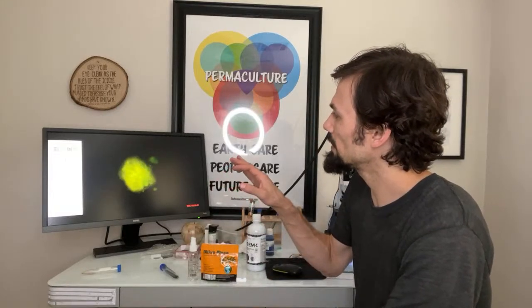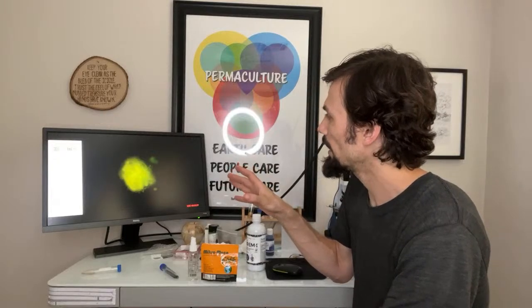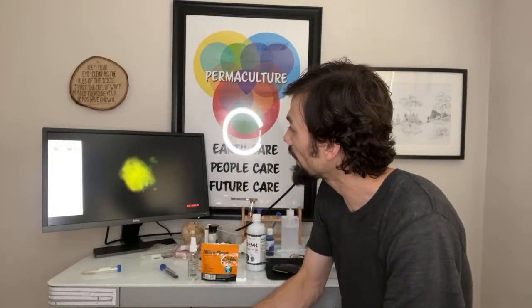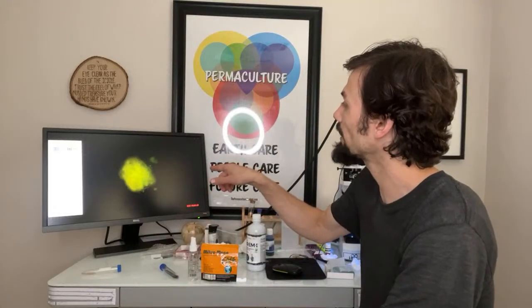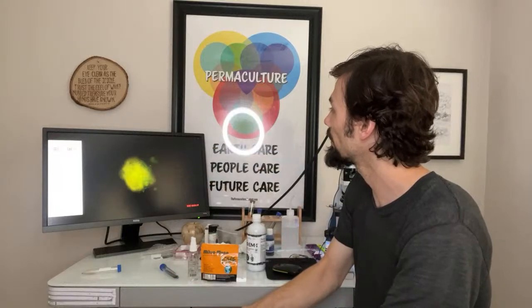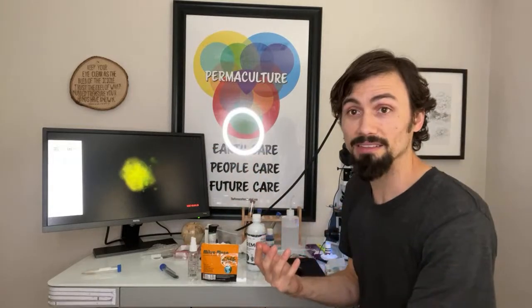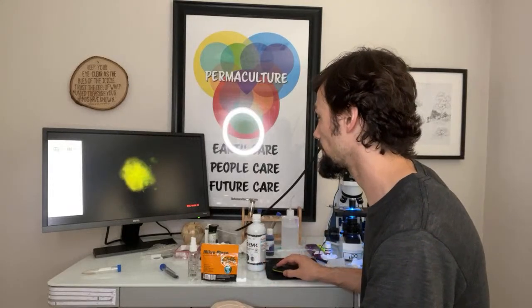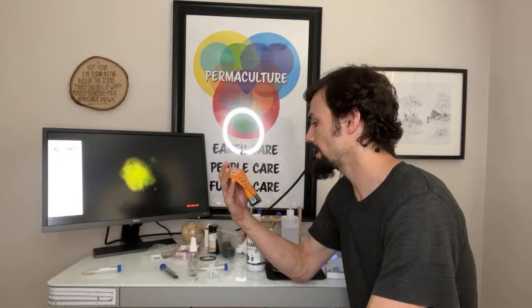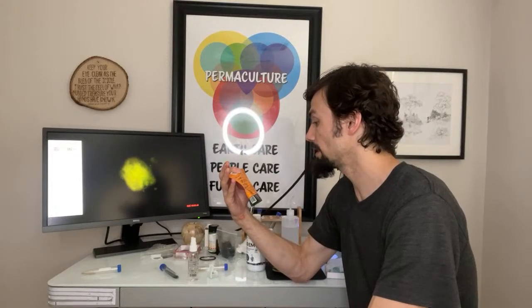But this is a non-uniform shape, so there's no compartments, there's no grid form, and it looks like they encapsulated and actually mashed up the fungi into fragments. That's why there's little pieces, and then put it into this little clay conglomerate. Looks like a little ball of clay with little crushed up pieces of fungi in it. And we're at 400x. So I'm going to take a picture of that. And this is Micro. And so it's endomycorrhizae, ectomycorrhizae, rhizobacteria, trichoderma. And it doesn't say what else is in here.